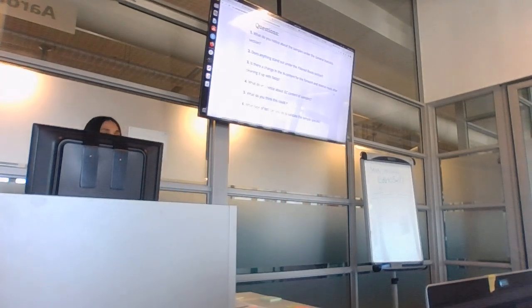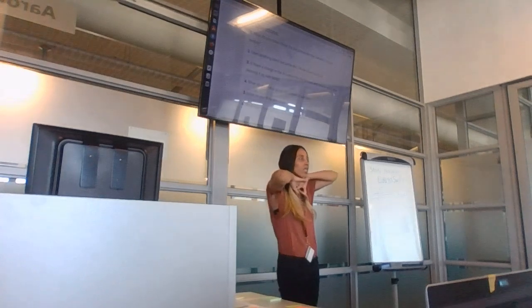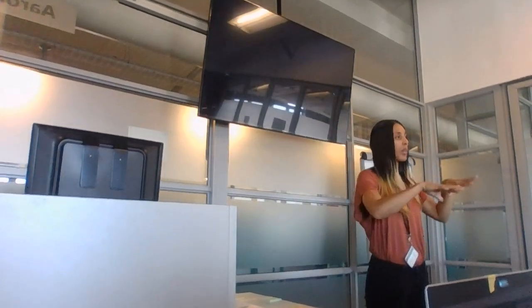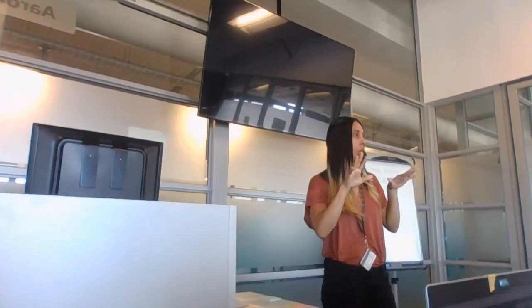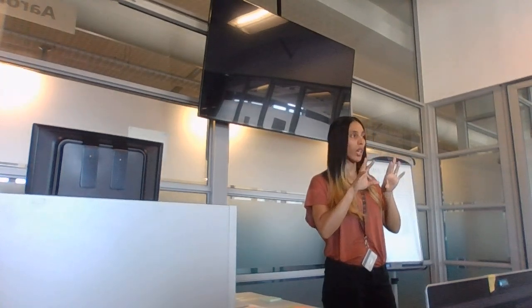But you have to first have some form of, in our case, we ran FastP, which is like FastQC on your samples. For some reason, we haven't figured it out, there probably is a way, maybe one of you has already done it, but FastQC with MultiQC gives issues. But if you do FastP with MultiQC, you seem to be okay.